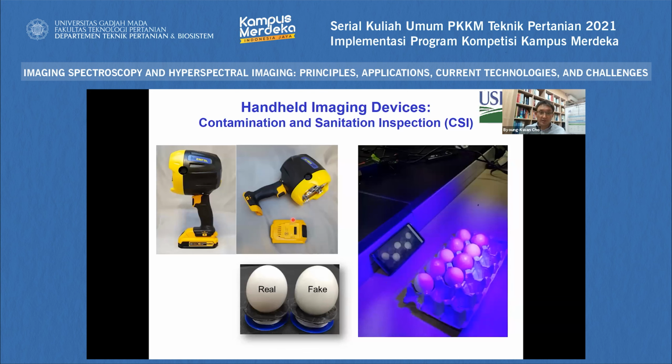That's why we use a very cheap handheld device instead of hyperspectral imaging, hyperspectral fluorescence imaging. But the research was based on hyperspectral fluorescence imaging. Without hyperspectral fluorescence imaging, we couldn't develop this cheap device.